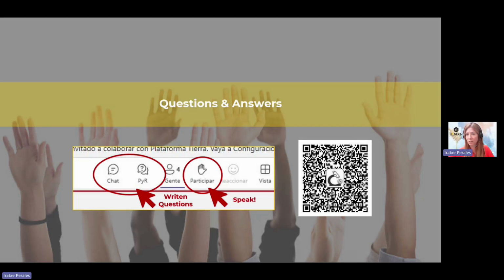About the validation, I already explained. How many pictures are taken per sample? It depends. As I explained, we have 4 different criteria to stop the test. So depending on how many fields we have to cover, we will have more pictures or fewer pictures. We scan in X, Y, and also Z. We focus, so we also take pictures depending on the Z.